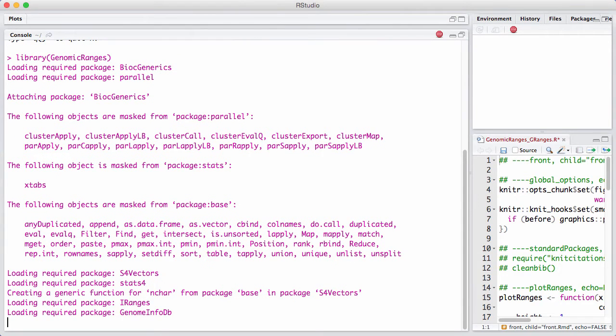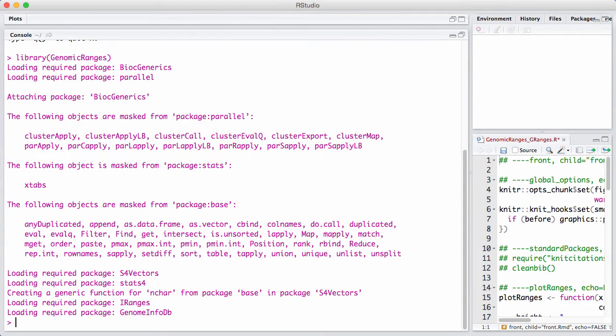A GRanges is constructed using the GRanges constructor, and essentially it's very similar to an IRanges, with some additional bookkeeping having to do with chromosome and strand.